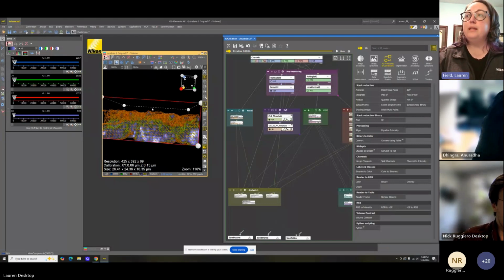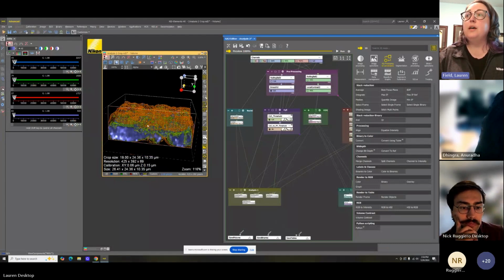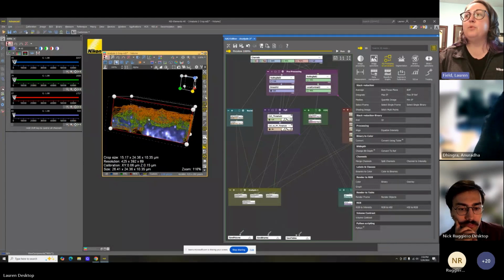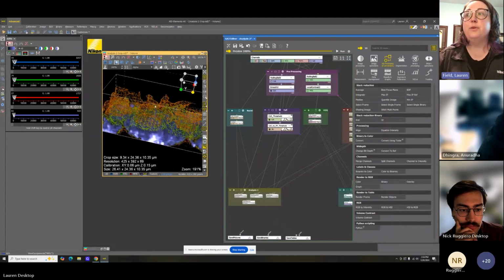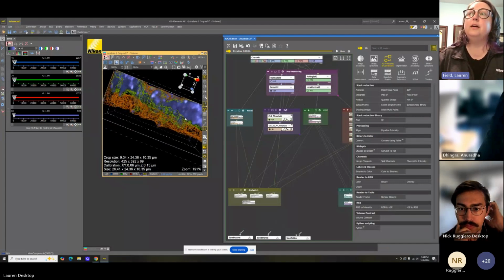So making decisions when you're doing this analysis, I'm going to try and crop in a direction. You can see how you get a much more amorphous blob, and we get a lot less specific labeling when we do not do any sort of pre-processing on the data that we're giving the threshold.